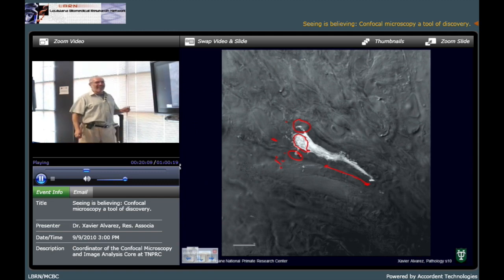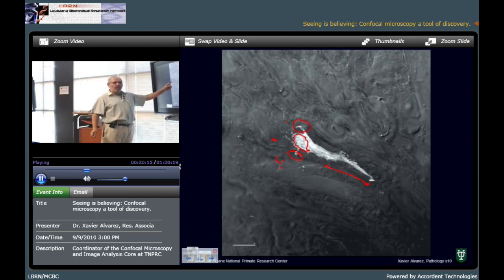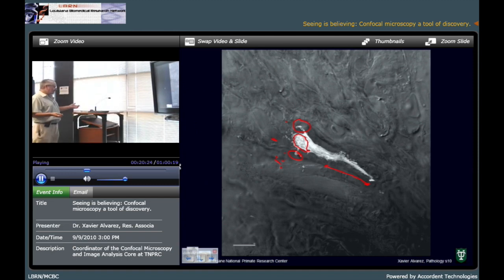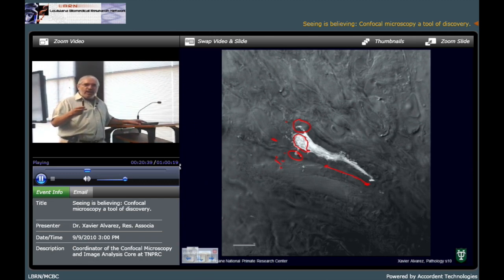And this cell is infected with the SIV virus. This cell was going to the point where we had the virus in the monkey, and it got infected there. Okay, but this is a very good way of studying locomotion. If I don't reach that, at least it gives you some ideas also. How the cells move is important, and with confocal microscopy, we could do this in tissue, either alive or in tissue from necropsy, that is frozen in time.